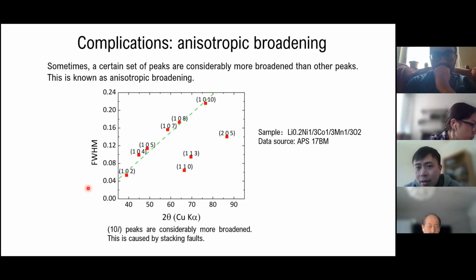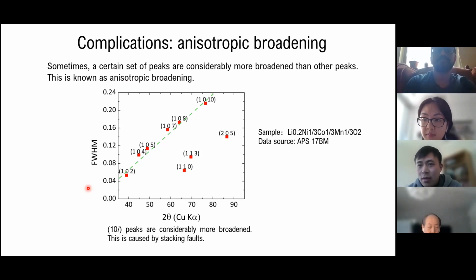my feeling is the phenomenon may not be that obvious, because when you think about the stacking fault, it's some sort of fault at a large scale, right? So if you have stacking faults, that's basically a large rearrangement of atoms. But when you have twinning or grain boundaries, their contribution to the total X-ray diffraction may not be that easy to tell. That's my guess. I see. So I guess those would be easier to find out from electron diffraction. That's right. Okay. Thank you.